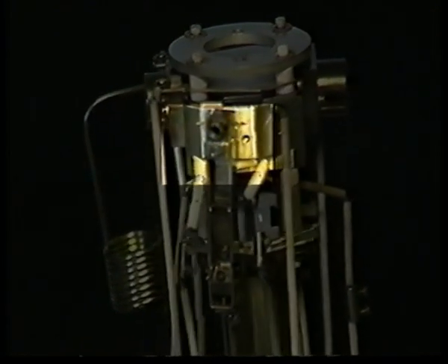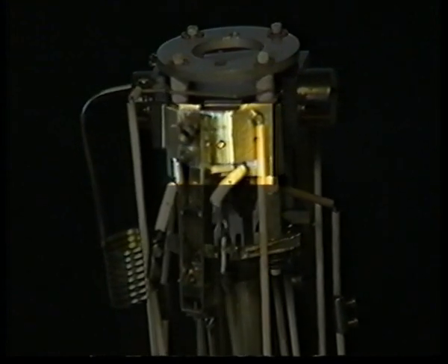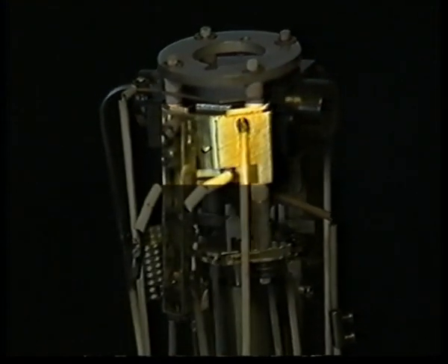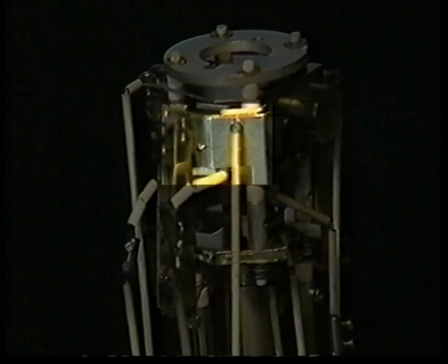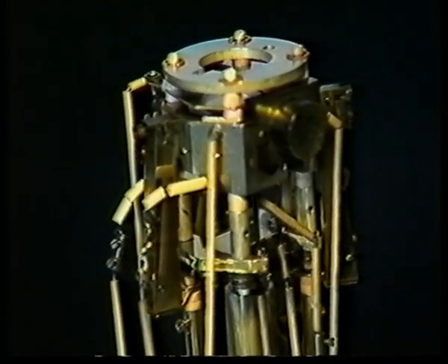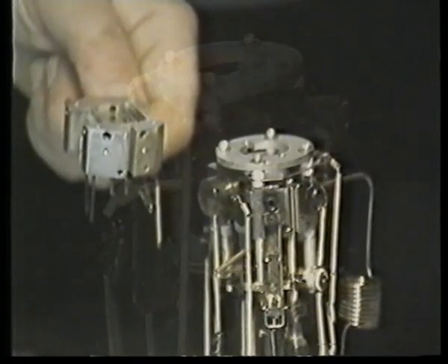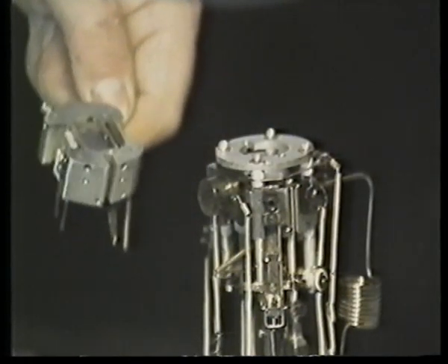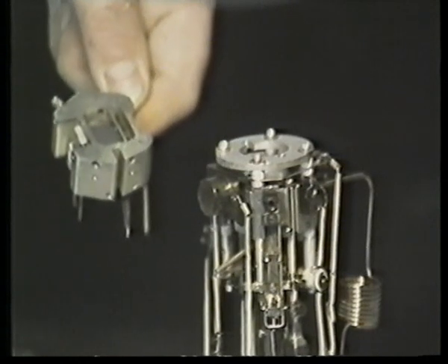In the middle of the apparatus is the iron block which you can see here highlighted. This is where the ionization actually takes place and is a type of ionization chamber. Here is another view where on the left we are showing another separated iron block.